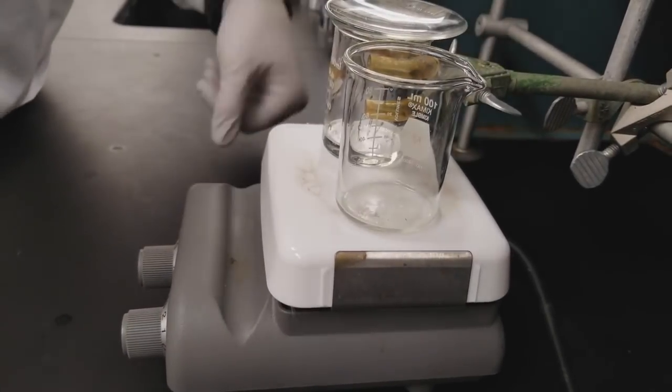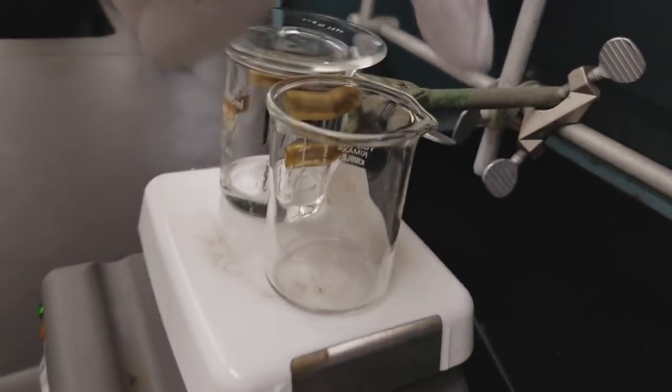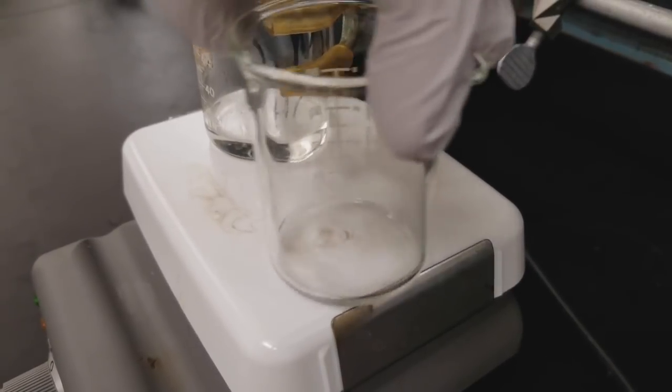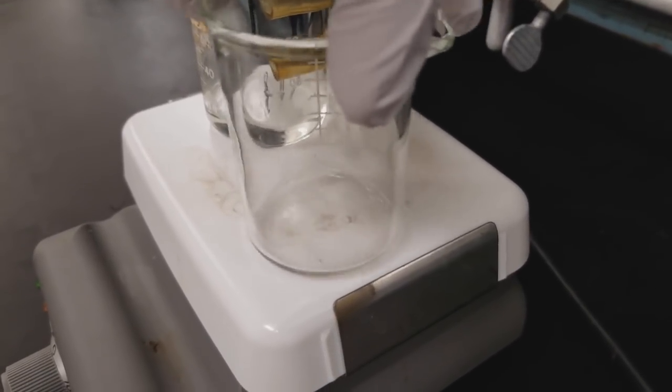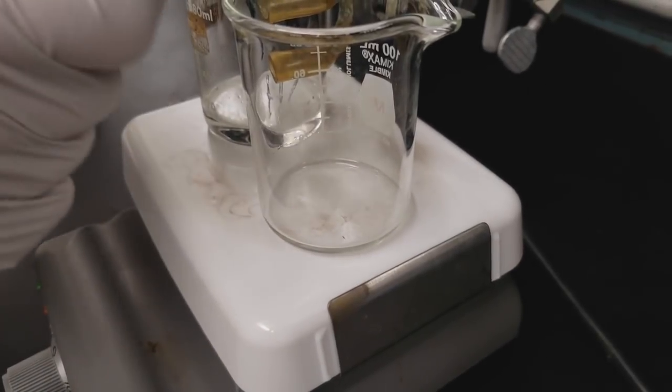And so once all the solid has dissolved, you are ready to begin the cooling process. So you can just remove your beaker from the hot plate and then you want to make sure that you turn the hot plate off so that you are not continuing to heat the solvent.